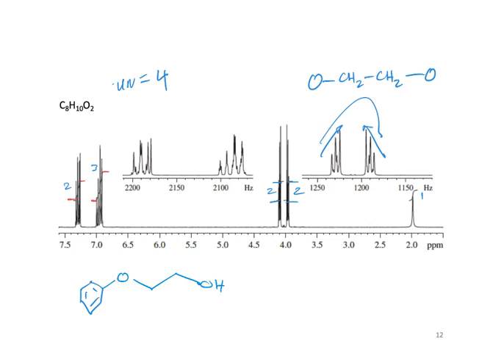Okay, so the other thing, let's just finish off by looking at the benzene ring section. So this little peak here is chloroform. So the solvent is going to be deuterated chloroform. We're going to talk more about solvents next time.